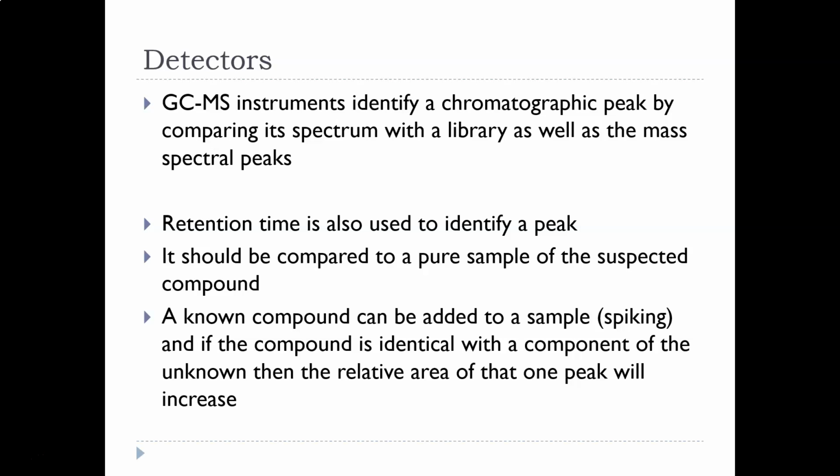To help determine with the GC, we can spike a sample, which is to add the analyte on top of the sample. It's kind of like standard addition. It can be done quantitatively, but in this case, it wouldn't be. You would test the pure chemical by itself, then add a little bit of one of the chemicals you think is inside of it, and then test both and look to see what happens. So let's say we have an unknown that has two chemicals, and this is what the unknown looks like.